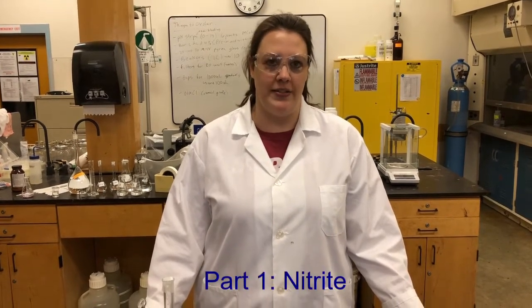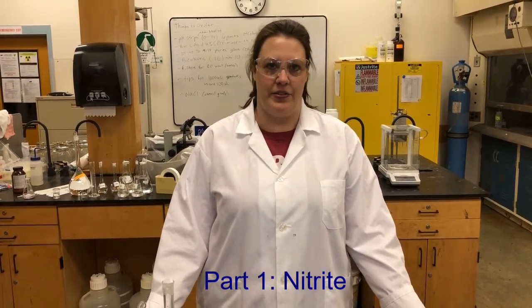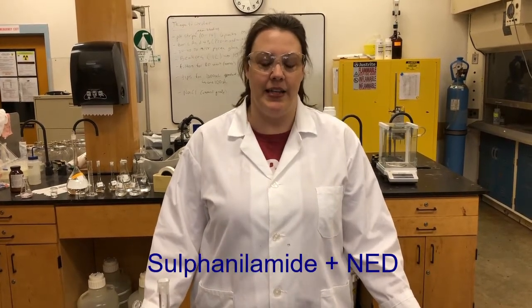Hi everyone. So today we're looking at determining the nitrate and nitrite content in samples. So we're going to start with nitrites, and the nitrite determination is a two-step process. We have two reagents, sulfanilamide and NED. The first reaction is with sulfanilamide, and that produces a diazonium compound when it reacts with the nitrites.